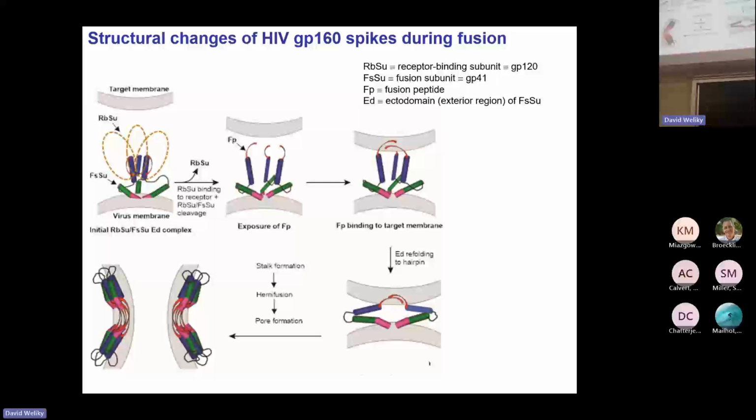So I would say our major contributions to the field have been to elicit and determine the structures of much of the fusion subunit section of the spike, particularly the sections that bind membranes and that are most important in fusion catalysis. And then we've also been very focused mechanistically to understand how it is that this fusion subunit reduces the barriers that make the fusion and therefore the infection processes possible.